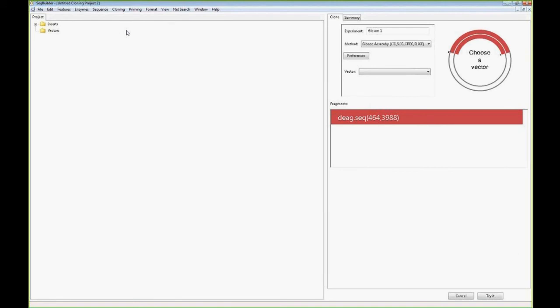Upon selection of the cloning technology, a cloning project window will automatically populate. This window will act as an interface for the cloning project and track target, vector, and result steps for the project. The window is divided into essentially 3 parts. There's the project tab, which will keep a running track of what inserts you're adding, what vectors you're utilizing, and the resulting clones that will be propagated and the targets that will be amplified.